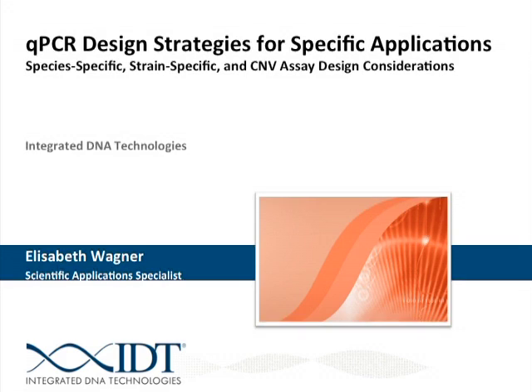Right, so for this last session today, I'm going to go through a few of the more specific design considerations, and hopefully, if the technology cooperates, we'll do some live demos of these designs. So bear with me, this is going to be less formal of a presentation and more going out to the websites and putting data in and seeing how to manipulate some of the things that we talked about earlier for some more specific design considerations that aren't just your basic qPCR assays.